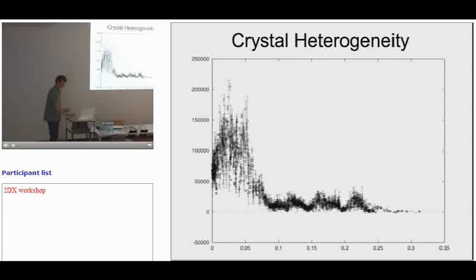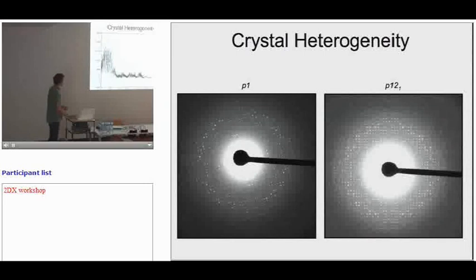And so after looking at it for a while, I realized that I'd had multiple crystal forms in one button. This is all from one 50 microliter button I collected all these diffraction patterns from, which usually you'd assume would be one crystal. But looking through the literature, there are a few examples where even within one sample, there were two or more different crystal forms that were present.